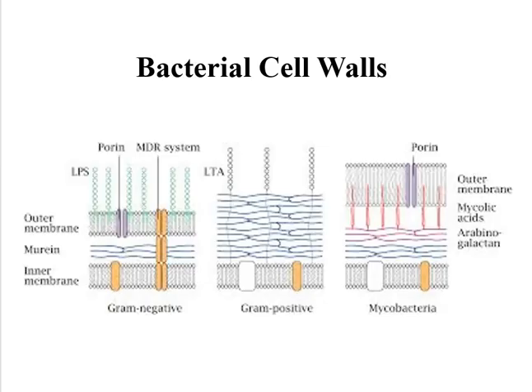Okay. So when we look at these organisms, we went through the gram positives. There's your peptidoglycan layer, very thick, and then your LPS for your gram negatives. There is a difference in Mycobacterium. They have an outer membrane and they have these mycolic acids. Slightly different. We'll talk about this in a lecture in greater depth, but they have mycolic acids in their cell walls. So it does make them a little thicker and a little different.